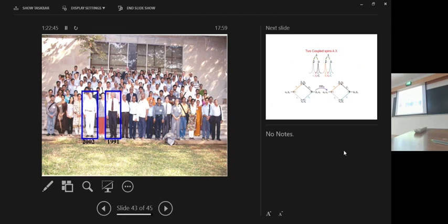The proteins we generally produce now have nitrogen-15 and carbon-13 labels. Otherwise, you can't do these multi-dimensional experiments. For this labeling, we need to do biology. Proteins have to be expressed inside cells which grow on a nitrogen-15 source or carbon-13 source. They incorporate that into the protein, so you get uniformly enriched carbon-13, nitrogen-15, or doubly labeled proteins. So it's an integration: biology is getting integrated into our work.